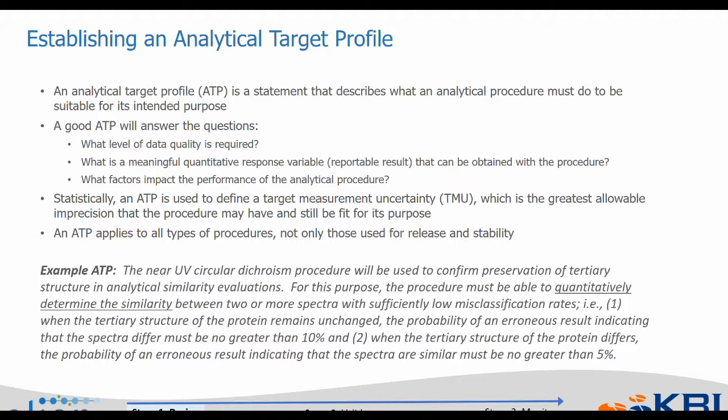And this is where we need to ensure that whatever method we're using can be reduced to a numerical output. And then third, what factors impact the performance of the analytical procedure? And this is where we need to study the impact of factors such as day and analyst and other types of robustness and intermediate precision factors.